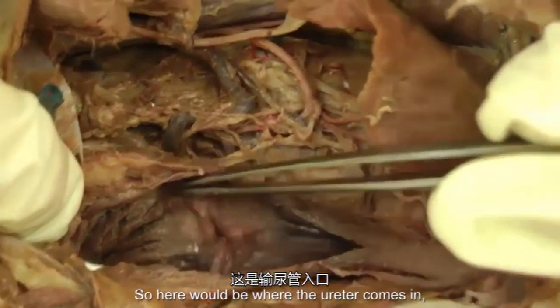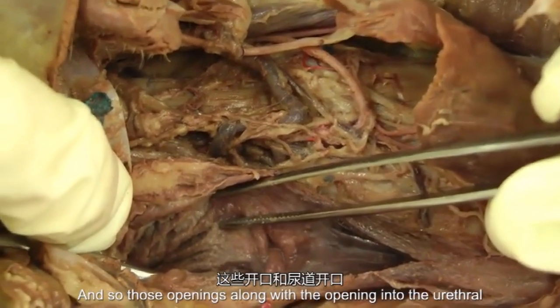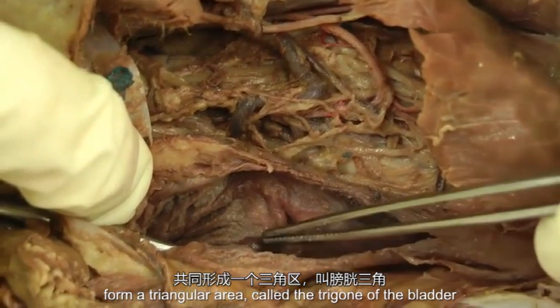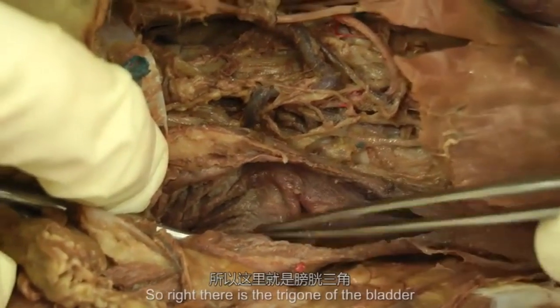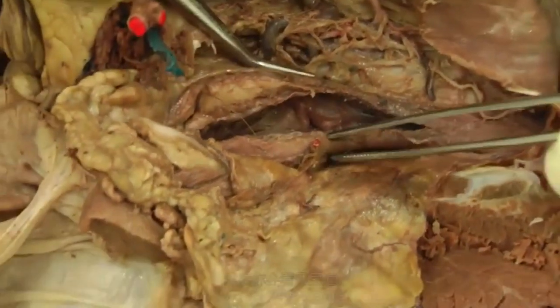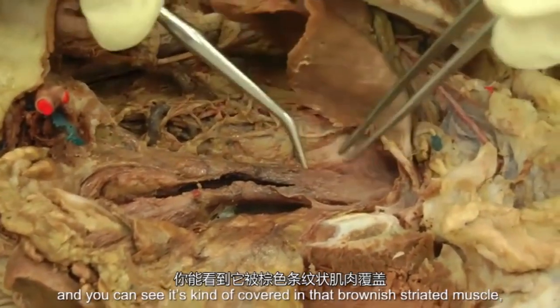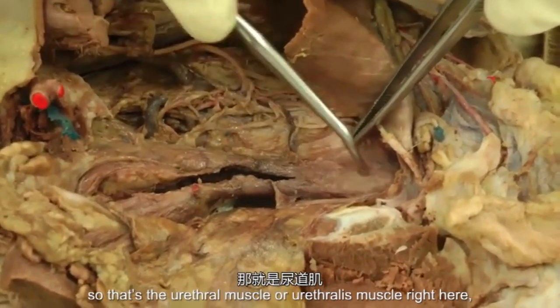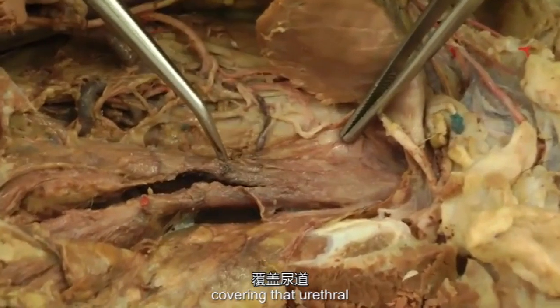So here would be where a ureter comes in. Here's where the other ureter would come in. And those openings, along with the opening into the urethra, form a triangular area called the trigone of the bladder. So right there is the trigone of the bladder. Then we have the urethra here, and you can see it's covered in that brownish striated muscle. So that's the urethral muscle, or urethralis muscle, right here, covering that urethra.